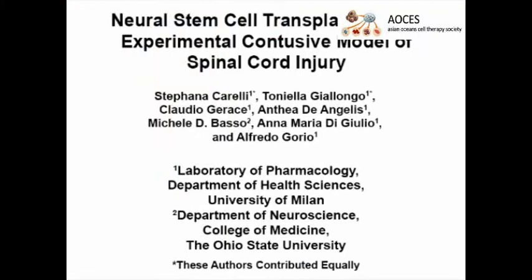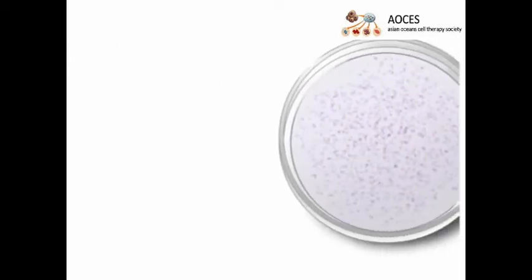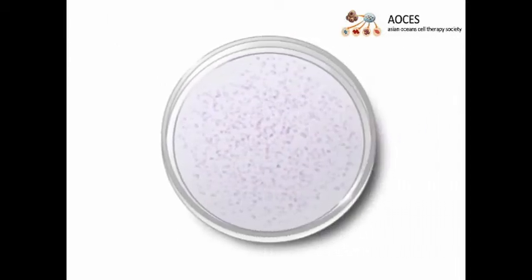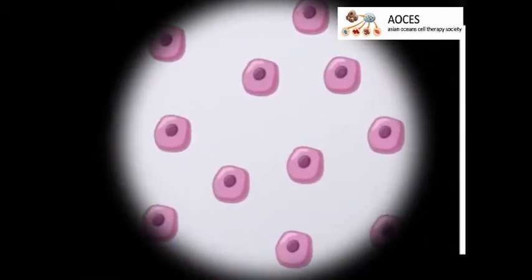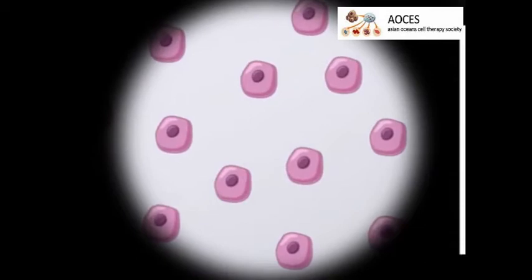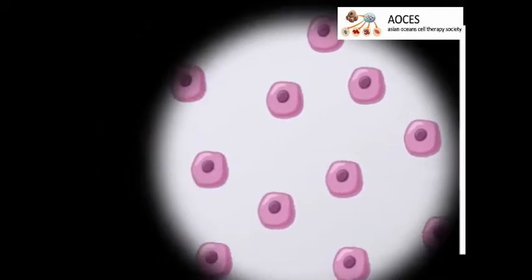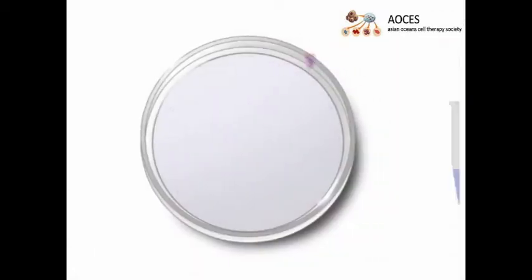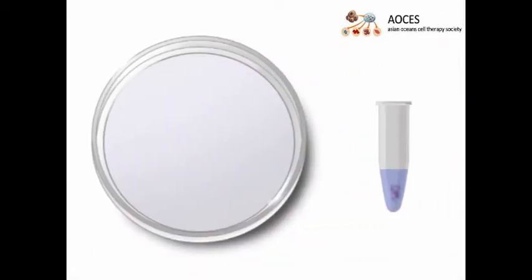The overall goal of this procedure is to describe in detail a contusion model of spinal cord injury in mice, followed by a transplantation of neural stem cells. This is accomplished by first labeling post-mortem neural precursor cells, or PMNPCs, with the vital tracer PKH26.